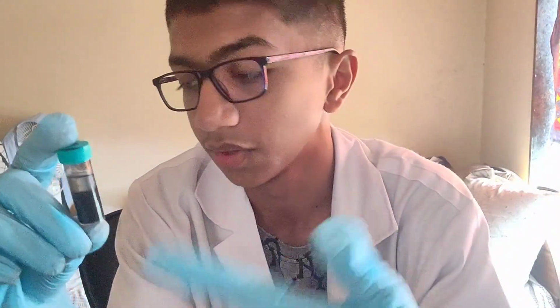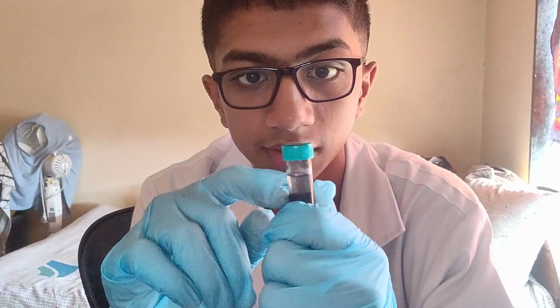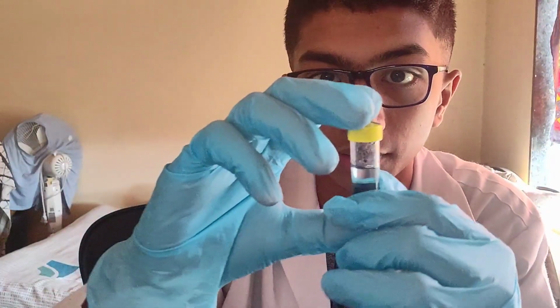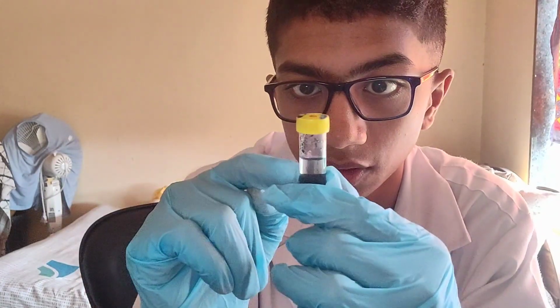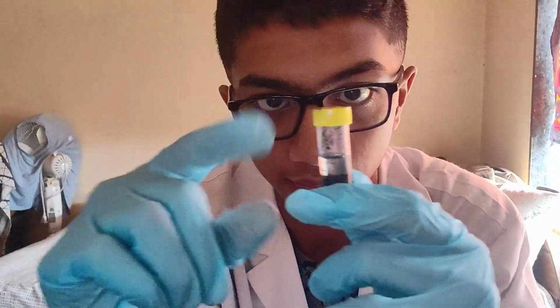Maybe the coloring that's in the sanitizer might have mixed with the water, and as a result we can see the blue tinted water here, while it's not actually ethanol. That could be possible, but let's see what the real issue is. We'd have to figure that out after we are done with this, obviously. Same thing with the first ever sample: the graphite has fallen out of suspension, and the clear liquid here is tinted.